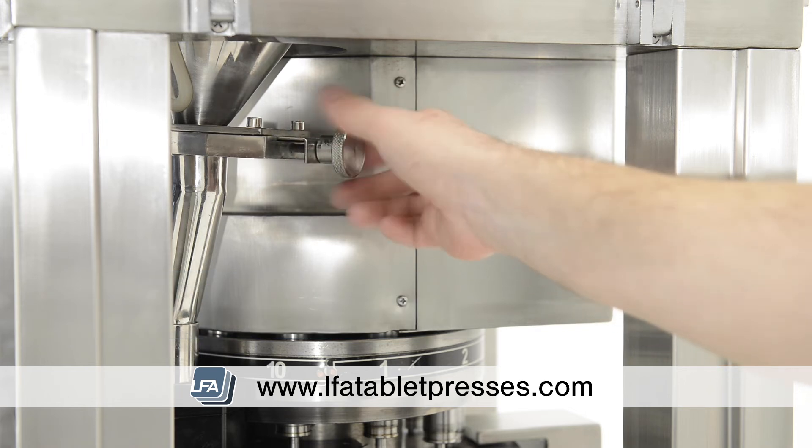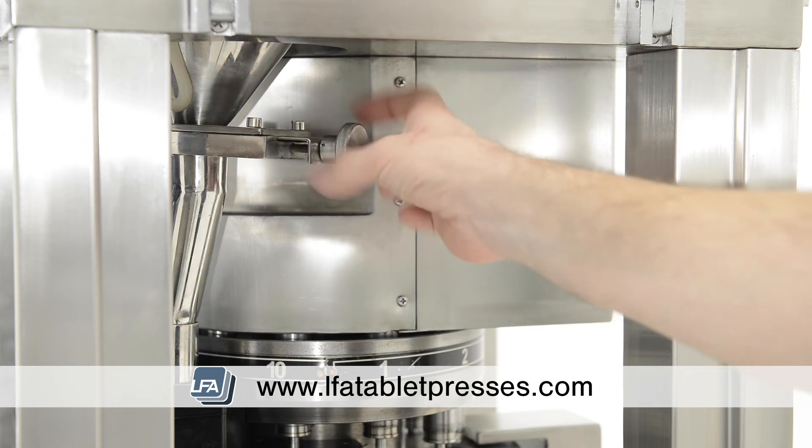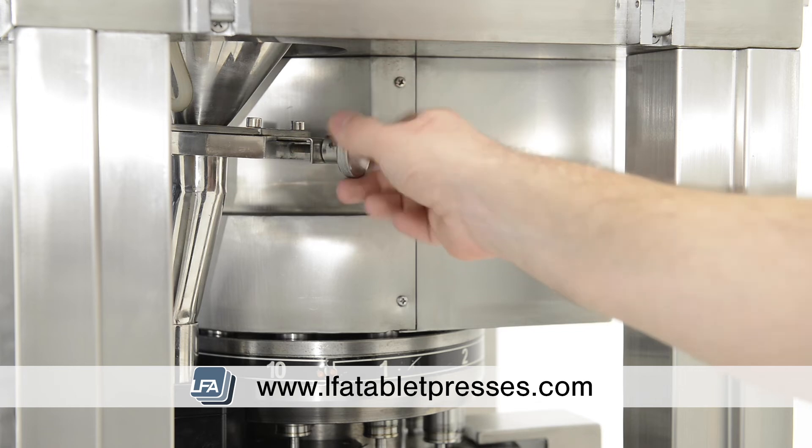However, if you do find your powder is still not flowing correctly, you may need to consider granulation for your formulation.